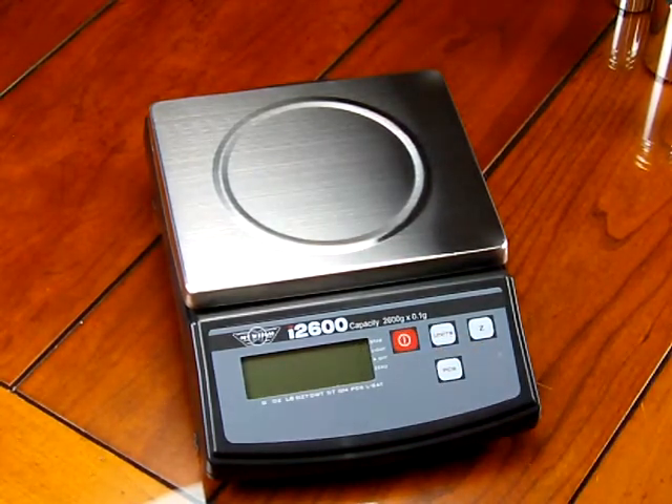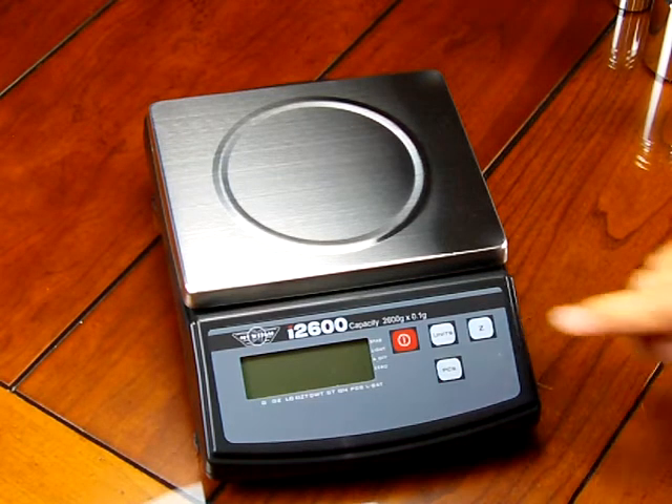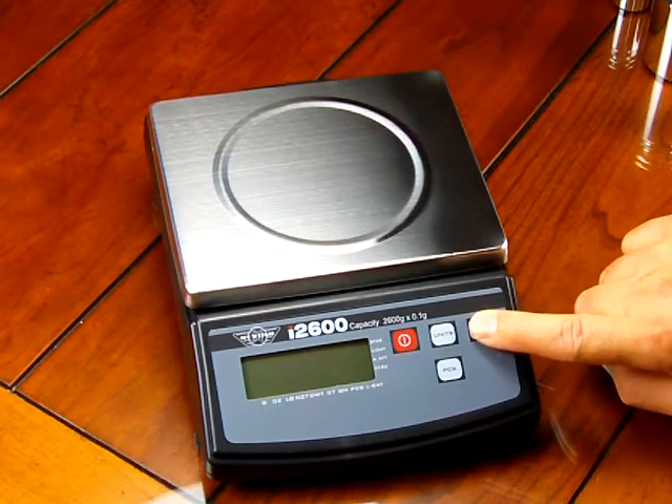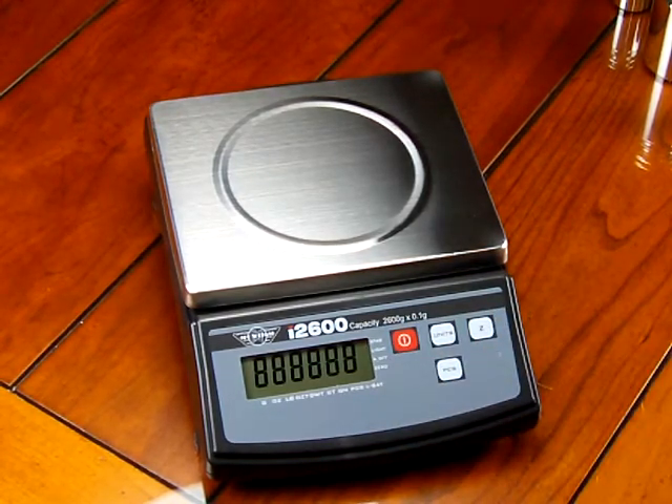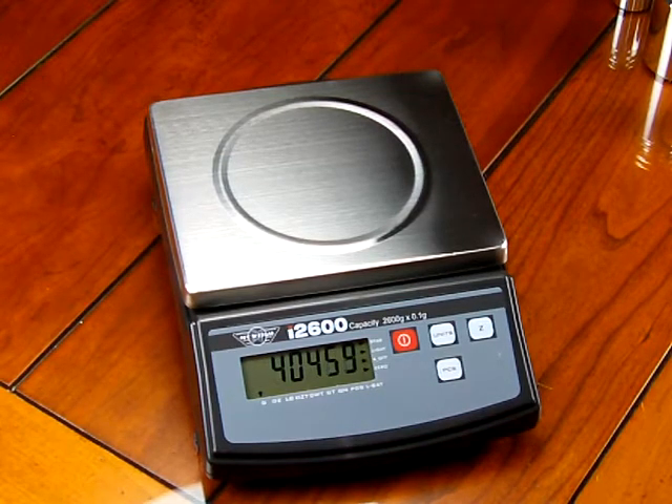The first thing you want to do is power off your scale, then hold down the zero key. While holding the zero key down, press the on key, then release. The scale goes to all eights for a moment, then shows a random number. This random number is what the ADC converter is reading off the load cell. You want to wait until it's stable — on this particular scale it reads around 40,454 to 40,457, but it's pretty stable. That last decimal place is going to move around no matter what.